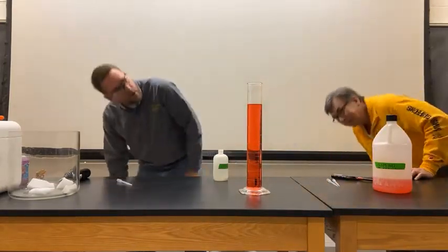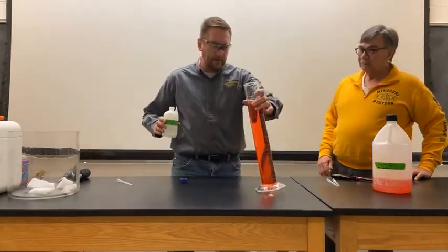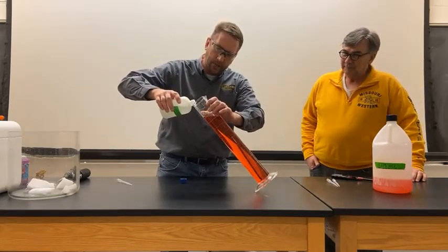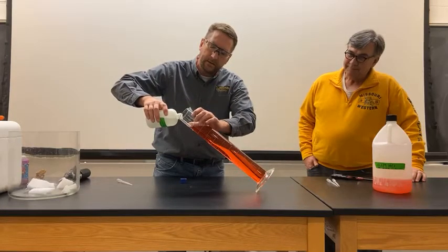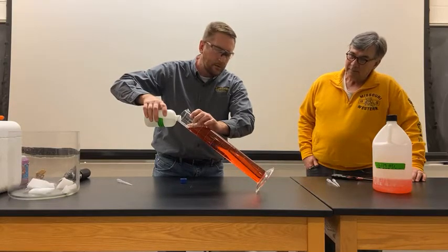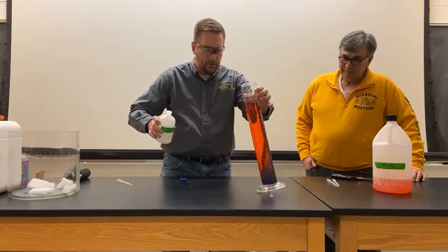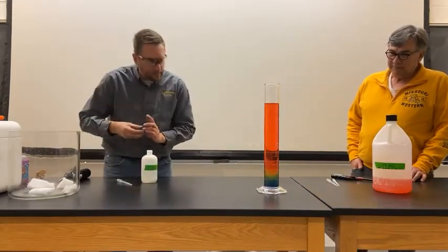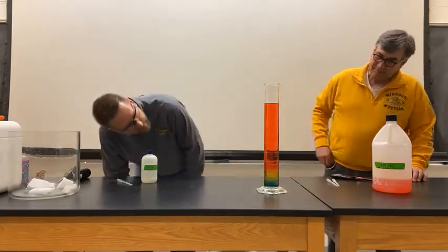Okay, so far, not much, right? Okay, let's add a little bit more here. We're going to go and put quite a bit in. Okay, and I'm going to do it really slowly so that we try not to mix it. All right, so now let that develop here for just a second. You can even see the bubbles forming.